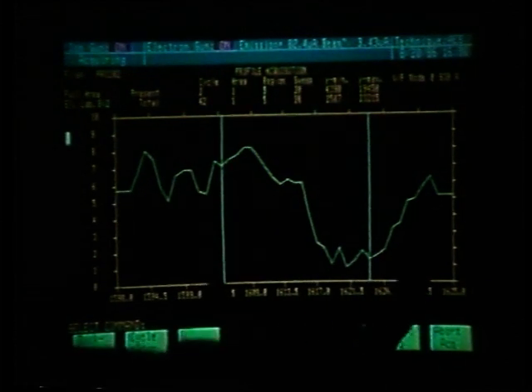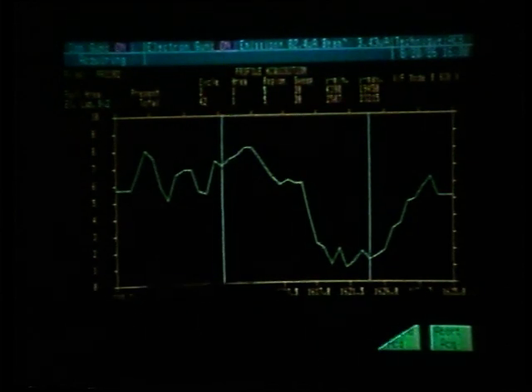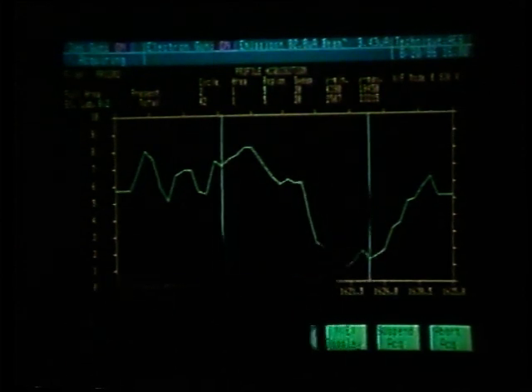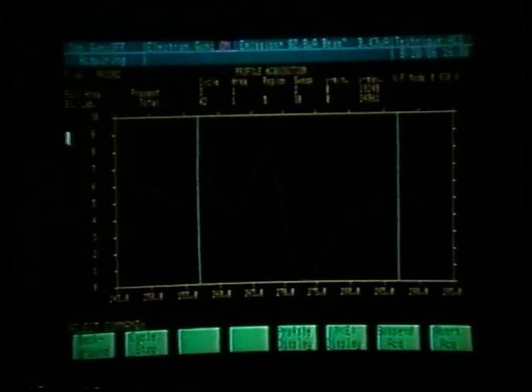The peak is actually not within our analysis window. It is within our acquisition window, but not properly defined by the analysis window. We need to bring the upper limit of the analysis window, it looks like probably to 1630.